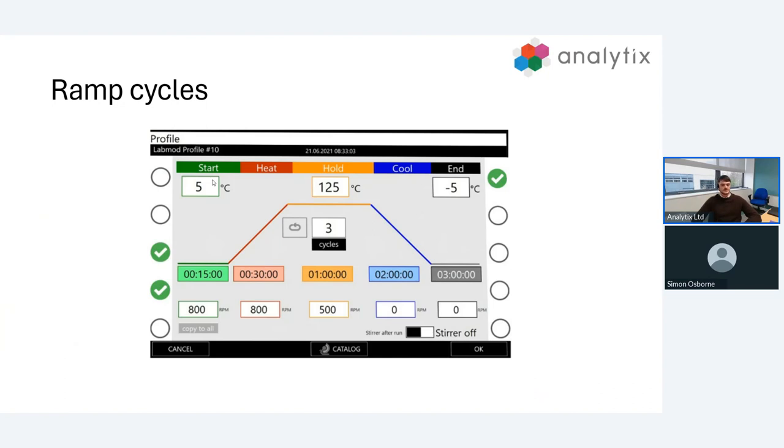We can also save ramp cycles. If you see the button at the bottom saying catalogue, this is our ramp catalogue. We can save methods that we'd like to use in the future here, and we can then simply press on them and apply them for future use.